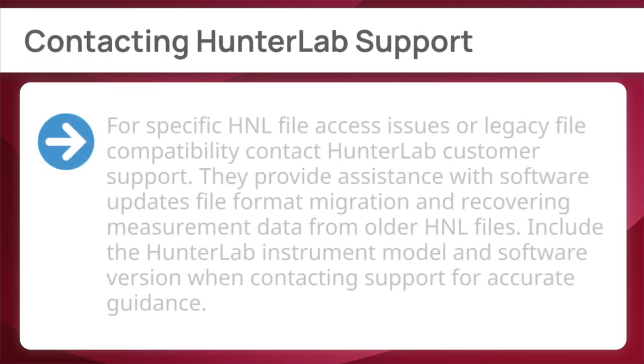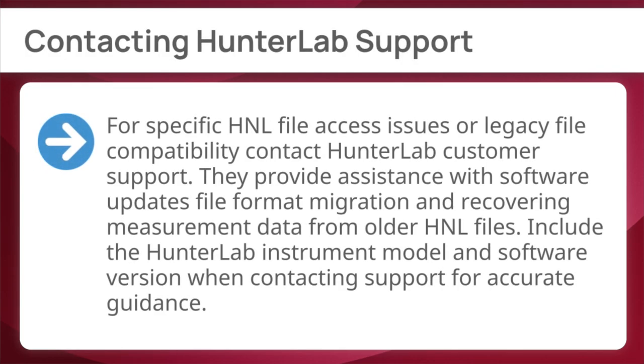Finally, contacting HunterLab support. For specific HNL file access issues or legacy file compatibility, contact HunterLab customer support. They provide assistance with software updates, file format migration, and recovering measurement data from older HNL files. Include the HunterLab instrument model and software version when contacting support for accurate guidance.